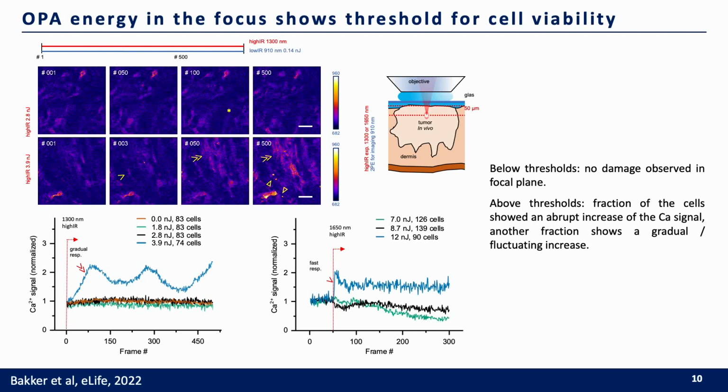And the calcium responses show signal increases before even any visible damage, so this really helps to establish a safe power density for multimodal excitation without causing phototoxicity.